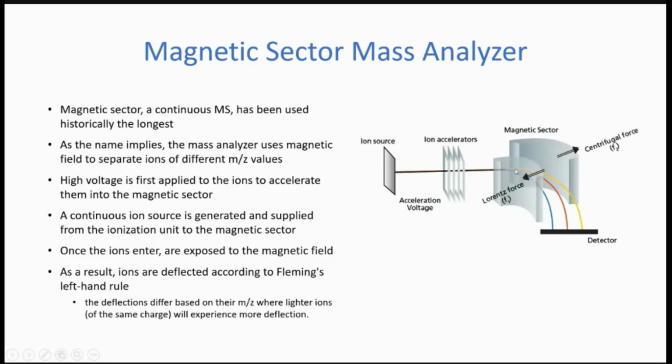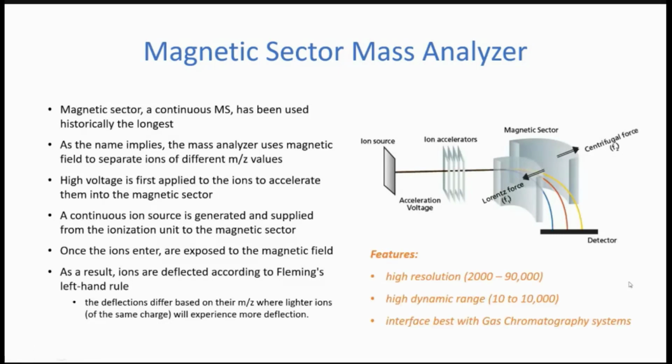And based on how far the ions are deflected or not, you can determine what the original mass to charge ratio would be. And so something that has a larger mass may not deflect as much as something that's a smaller mass. Smaller mass would have a larger theoretical charge density and therefore maybe get bent by the applied magnetic field in a stronger way.